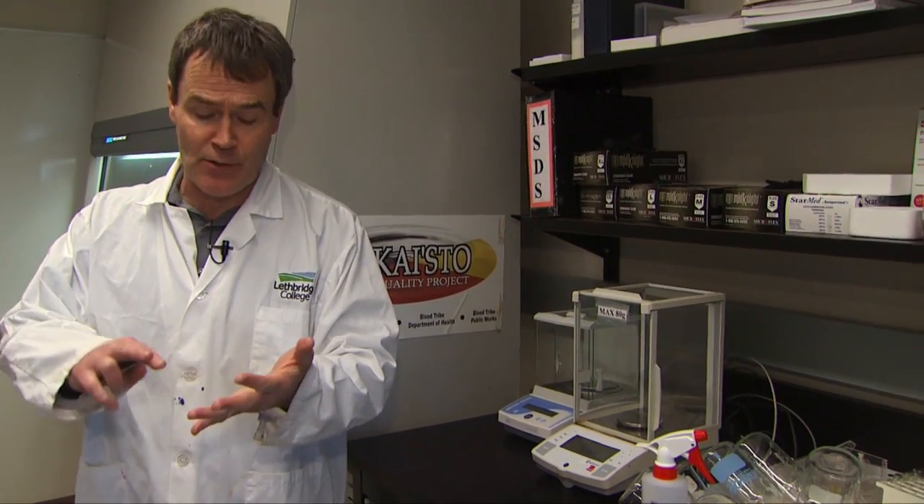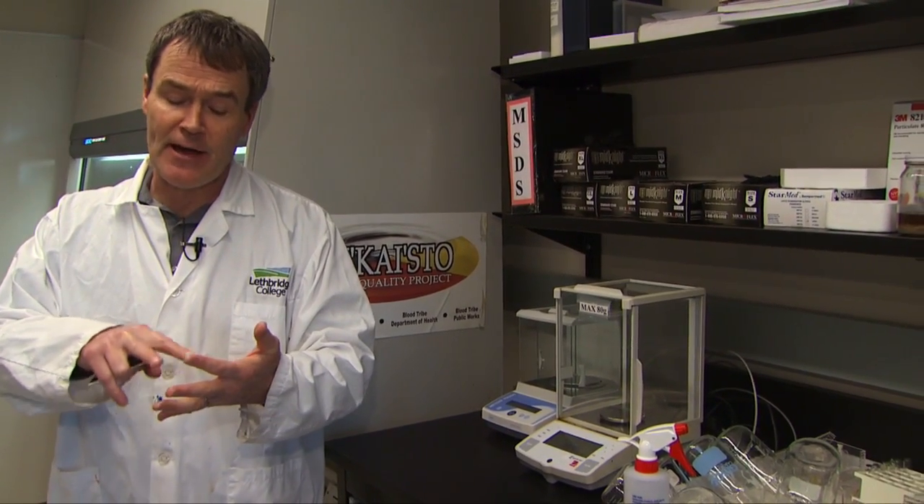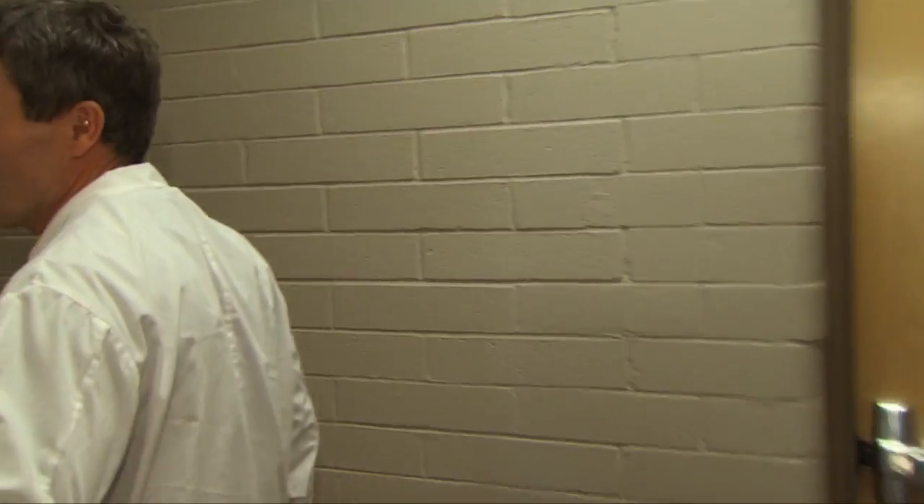This is our prep lab. We do a lot of our research prep in here. We do work on algae, we'll do work on Cryptosporidium and Giardia. We'll also do some extra work on water sampling — we'll bring in some water samples and do some testing.